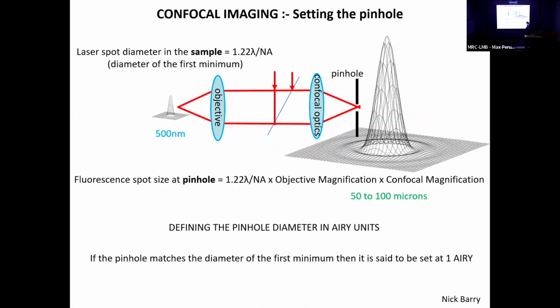In the confocal, we're doing various things. We're focusing light down to a spot, so we can't get an infinitely small spot. We've got this point spread function. That then is scanned around, and that generates fluorescence. The fluorescence goes through, and we put a magnified version of it. So we don't have 500 nanometer pinholes. We have a finite pinhole in the microscope.